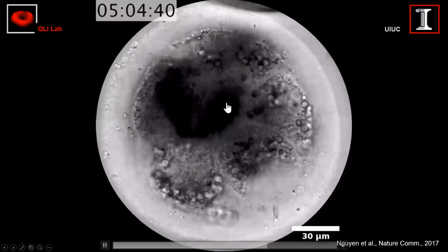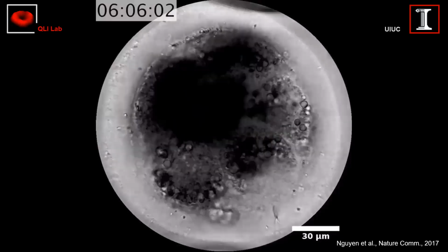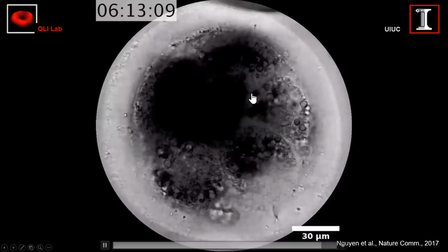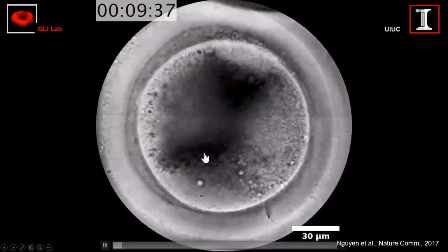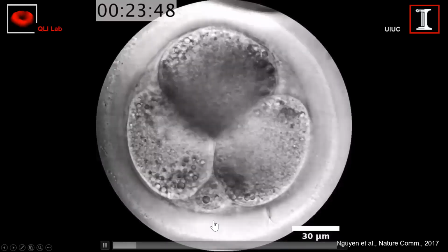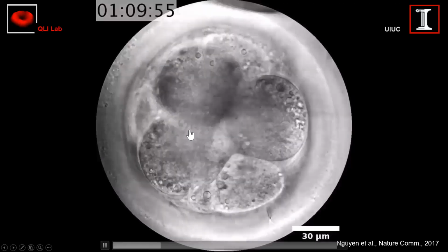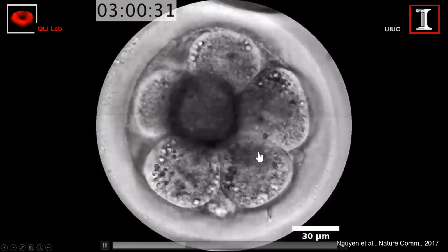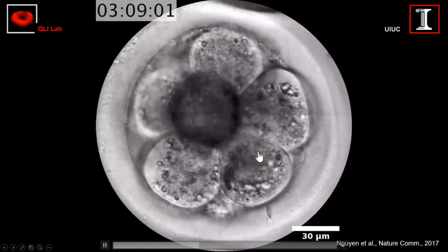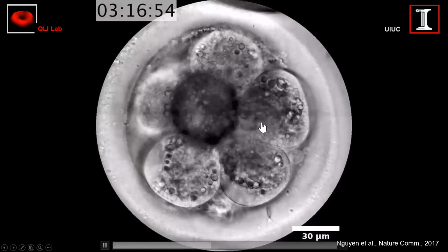And the whole challenge here is how can we predict this event, hopefully before it gets implanted in a mother, because you don't want this. The worst thing that can happen is to do the implantation, go through the whole process that also costs $20,000, $30,000 for humans, and then have this happen inside, and this is not a successful pregnancy. So we need to do this with the intrinsic markers without adding chemicals from the outside, but I think the opportunities and the payoffs are really great here.